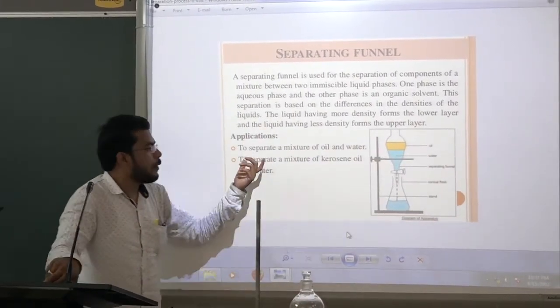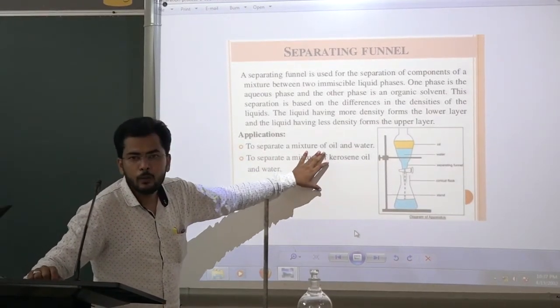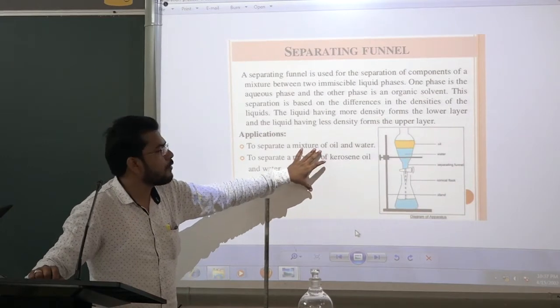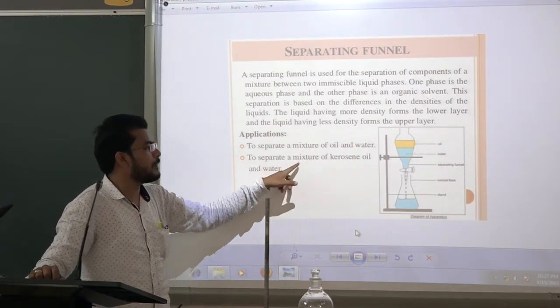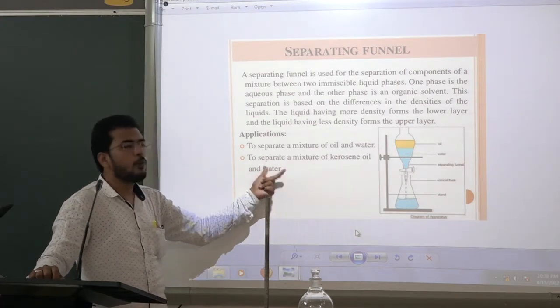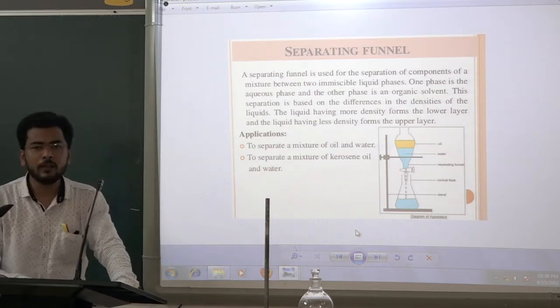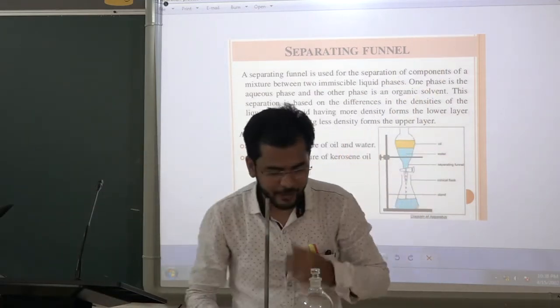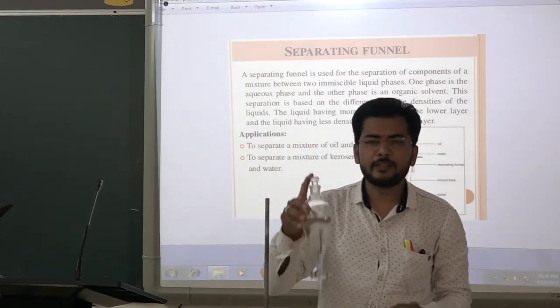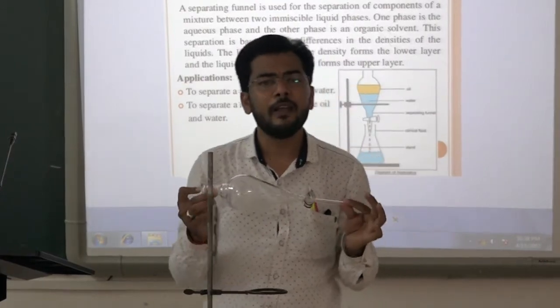So what are the applications of this method? One is to separate a mixture of oil and water. The second application of this method is to separate a mixture of kerosene and water. So we will see an activity for this separating funnel. This apparatus is known as a separating funnel, which is used to separate immiscible liquids.